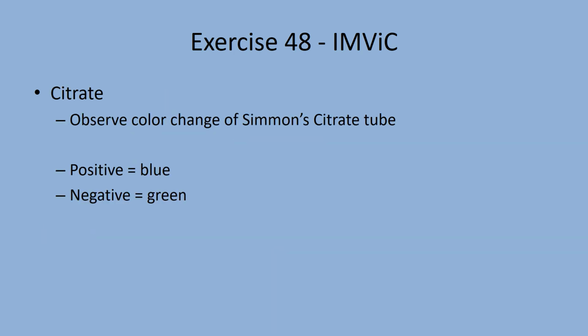And finally, the citrate portion of this test, you would have inoculated a citrate tube. Normally, it is green. If it remains green, it's negative. If it turns blue, it is a positive test.